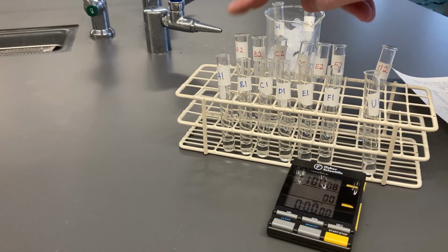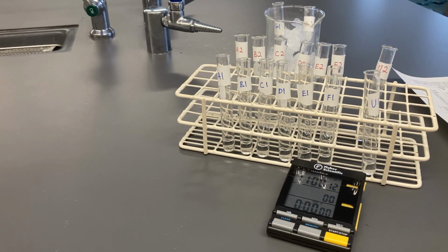So I'm going to be mixing test tubes A1 and A2, and I'll start the timer, and then you'll look for the reaction time. I like using a nice high percentage of starch so you can really see the reaction when it takes place, and it'll turn a nice dark blue color.